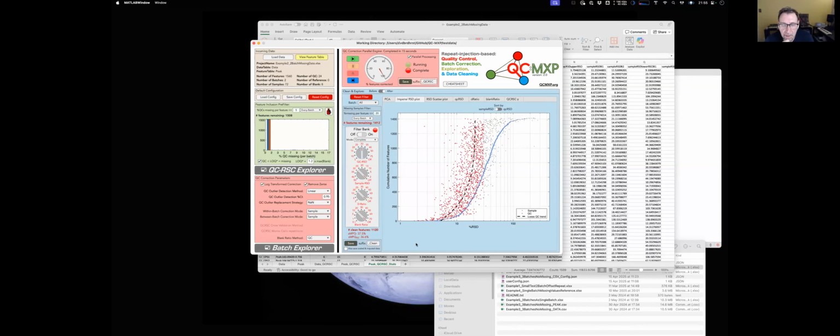Yeah, so because the between batch correction is simply a median correction, all you need is three data points. You need to draw a line. Obviously, the more data points, the less error you're going to have in that line. But the minimum you could get away with is 3, because that'll give you a line. I mean, you could do it on 1. It's just going to be a bit flaky. You could do it on 1, and it would just correct to whatever the value is. But it won't be able to take into account any error in that measurement.